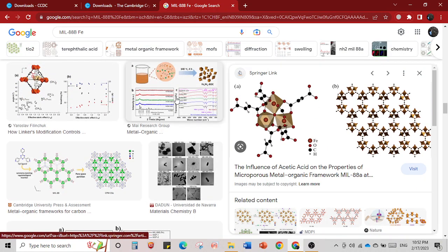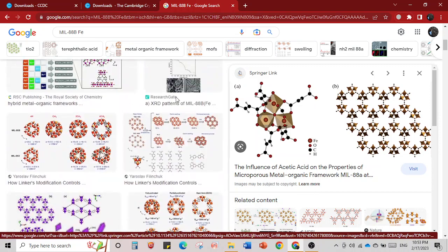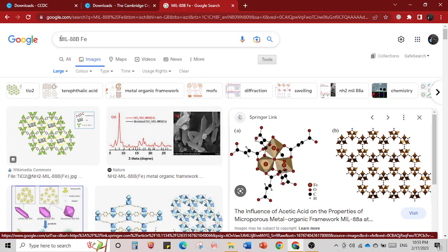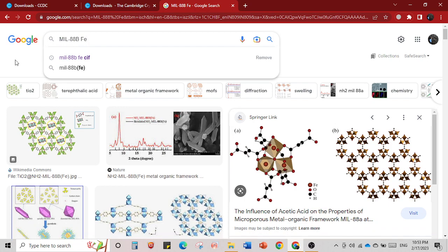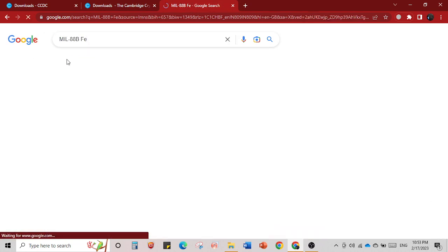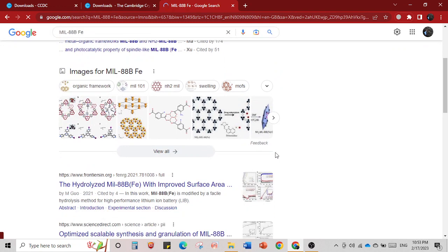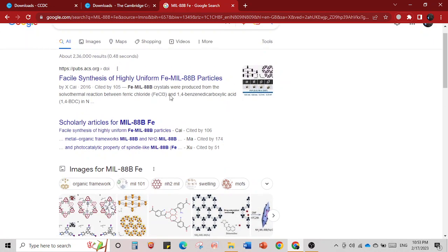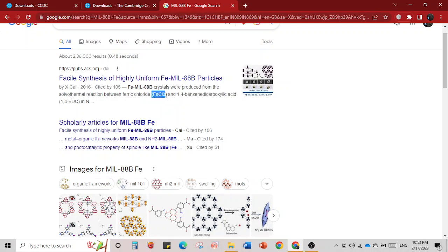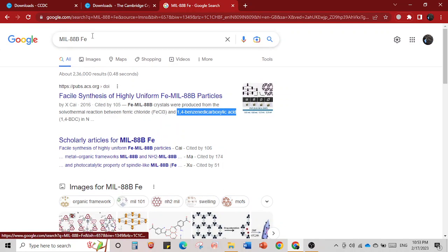When you download it there is an installation file — you run that file, it is very easy and very direct. The second thing we need is to understand how to download a CIF file. The example I am going to take is MIL-88B, which is a MOF — a metal-organic framework — synthesized from iron chloride and 1,4-benzene dicarboxylic acid, otherwise called terephthalic acid.